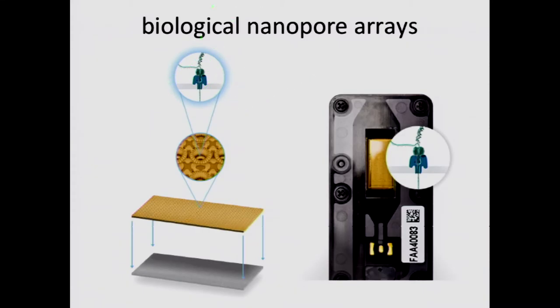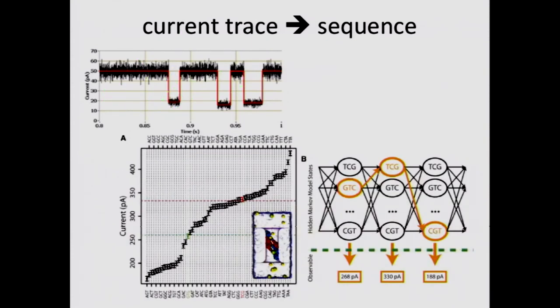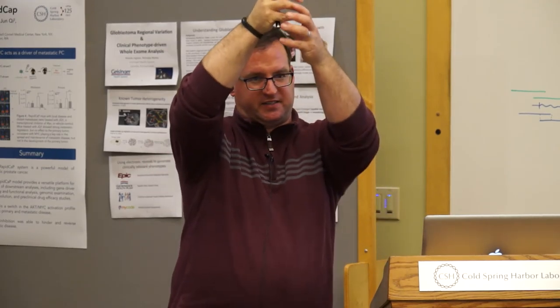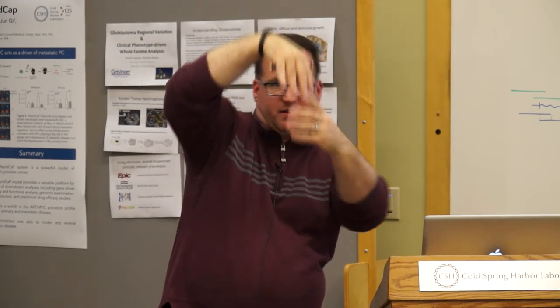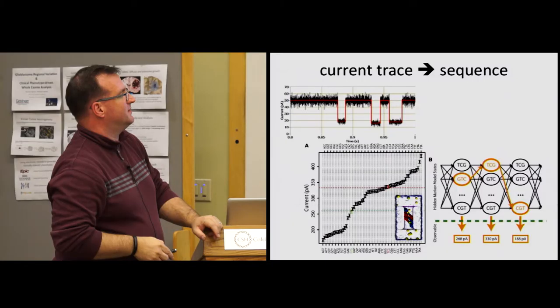So once you get that going, that DNA sequence will unzip, and the single strand will move through. As it moves through, each base is going to lead to a little bit of change, so this is essentially a trace of as each base goes by. It turns out that you don't actually get a punctate readout of individual bases, because it kind of slurps, it's not a constant motion. It's sort of like two or three slurp through, and then the next three or four slurp through, and then two or three slurp through. And at each one of those slurps, there's a different delta.